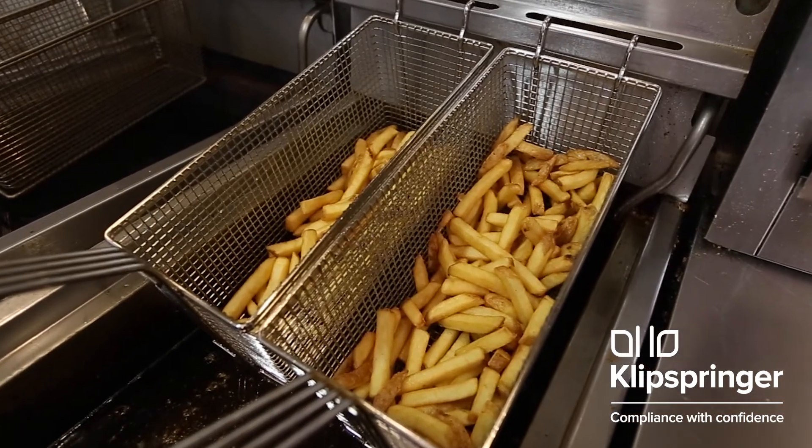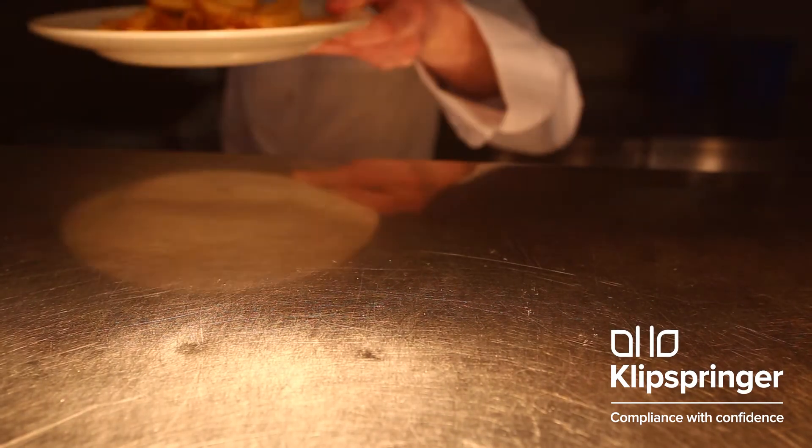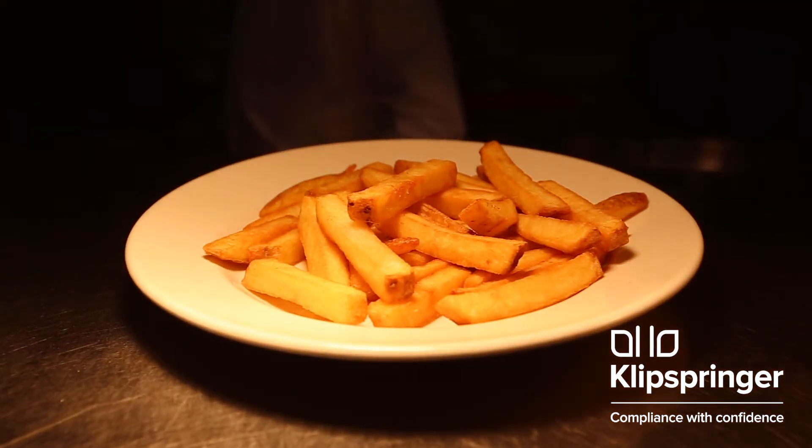Not only is this necessary for safe food, it also helps you achieve consistency from day to day and from location to location.